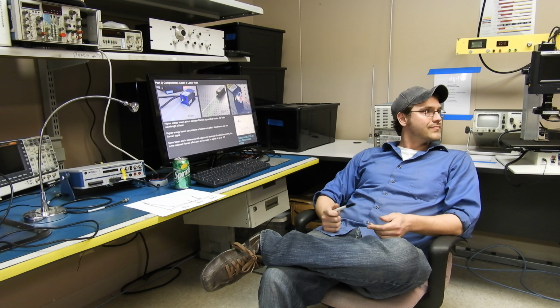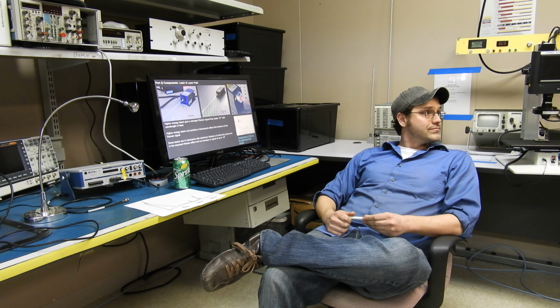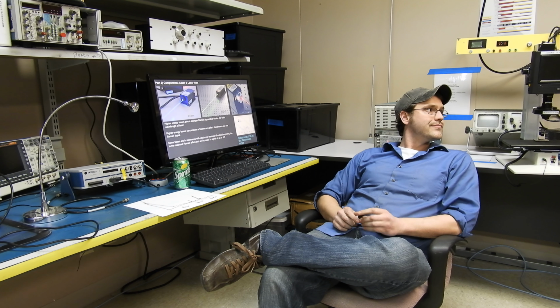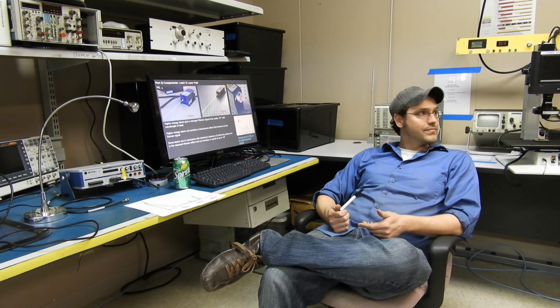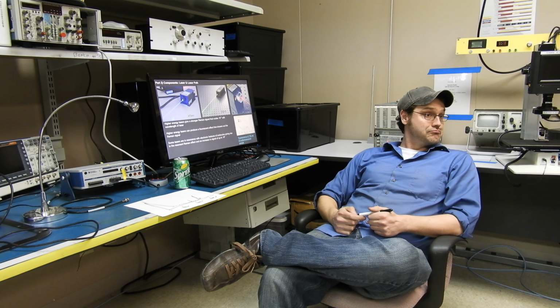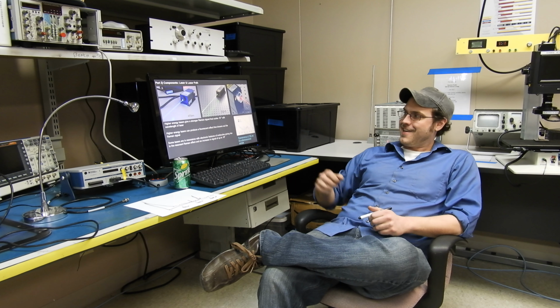So at this point, I could go over there and do some USB calls, and I could pull this data and I could drop it into an array in LabVIEW and plot it up on a screen. That is something that I can do so fast it will make your head spin. Wow. But I'm just, I don't know.